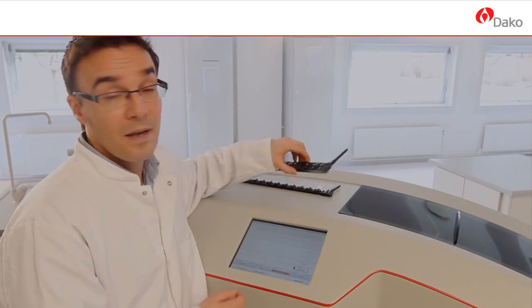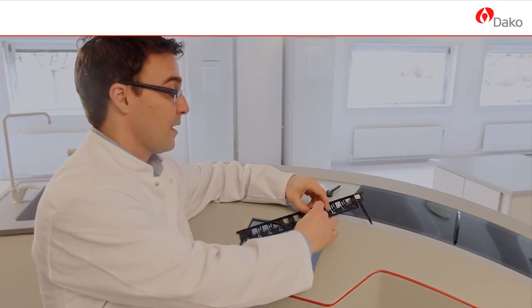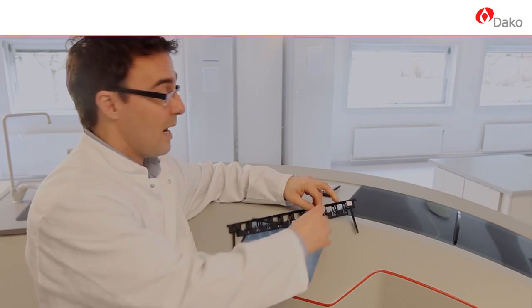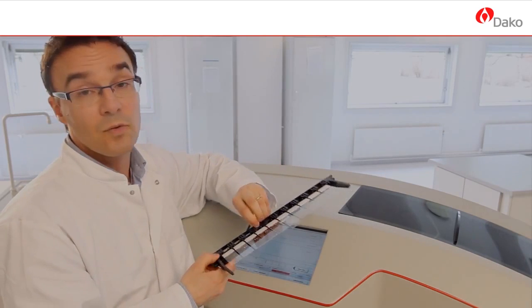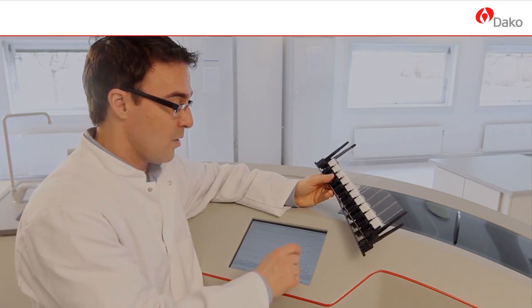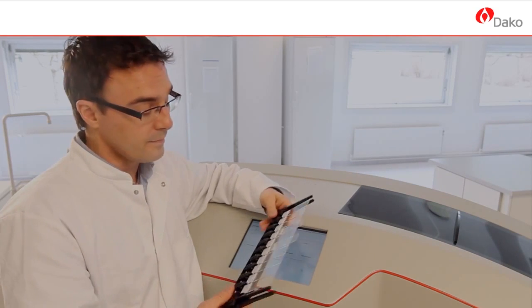So the user sits by the microtome. The cut sections are picked up on the slide. The slides are placed in the rack, and when the user has enough racks, they go to the Coverstainer. They tap the open tray button. The inlet comes out.